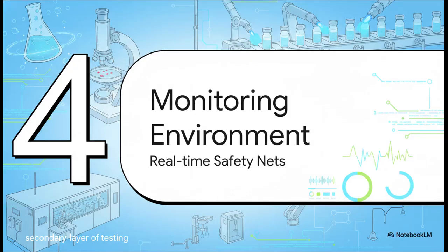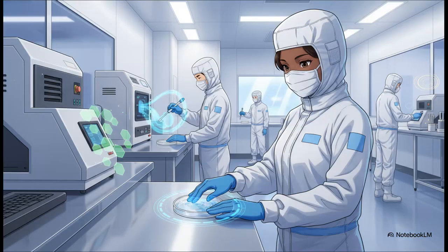Section 4, monitoring the sterile environment, real-time safety nets. Because while the simulation is running, there's actually a whole secondary layer of testing happening at the exact same time. We have this invisible safety net actively monitoring the clean room itself. We use a really strategic mix here. Active air monitors pull volumes of air right through slit-to-agar devices, while passive settle plates just rest quietly on surfaces. We use surface swabs all over the equipment. And, maybe most importantly, we do gloved fingertip and thumb testing on the actual human operators. We're actively hunting for both viable microbes and non-viable particles floating around the room at the precise moment the simulation is happening.